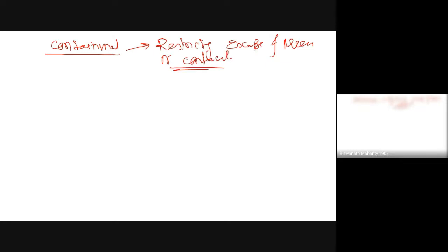You try to understand, we are normally talking that your media should be sterile, it should not get contaminated. Okay, I understand, that is required when I am doing fermentation. But sometimes we are also dealing with organisms which can be pathogens. In many fermentation processes, we are using different kinds of fungi. Fungi can be pathogenic for humans also. So not only do we need to keep the fermentation process sterile, and sterile means for the media itself I am talking.